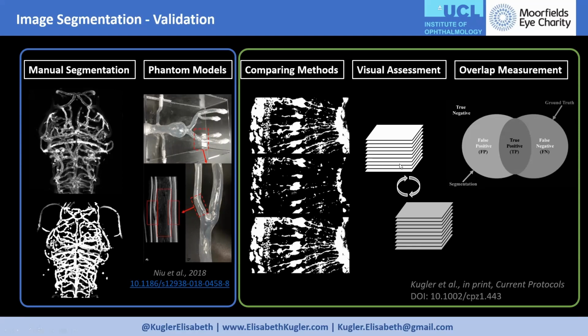Now, moving over to the biomedical sciences field, we have a different repertoire of techniques that we can use. So firstly, we can directly compare the images just with our eyes. So for instance, here we can see in the middle that this image is different to the other two. Most likely, evidently in the fact that these Müller glia are quite incomplete. The other two images look fairly similar, but there are subtle differences. So for example, like this spot over here looks fairly more dominant than this one over here.